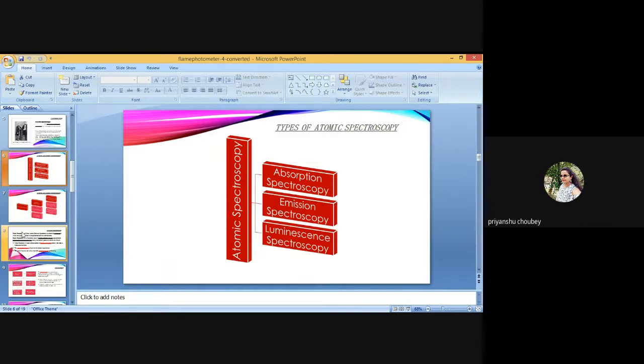Preparation of the standard and sample solutions. Prepare stock standards in concentration of 1000 mg per liter from a pure metal wire, granules, foil, metal oxide, or other suitable compounds of the elements.